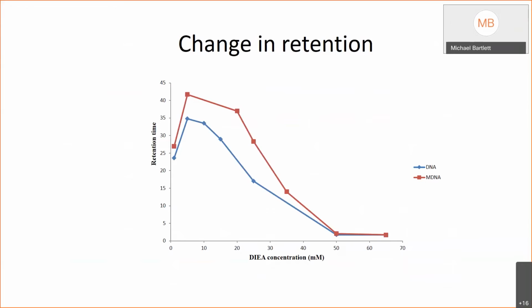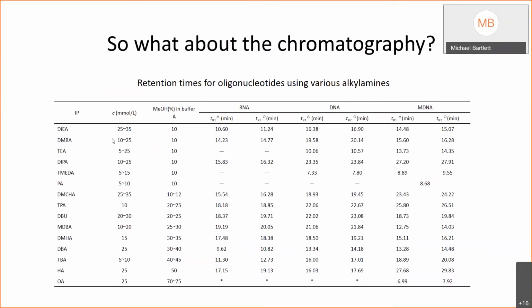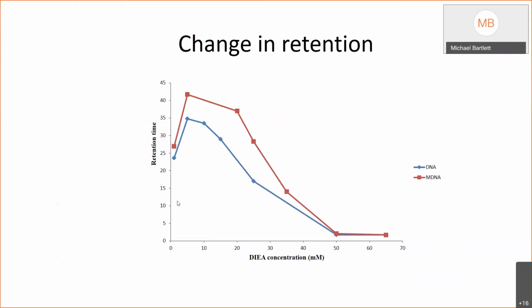This is another piece of data that was really causing me a lot of concern the first time I got it. In fact, it took me about a year just to wrap my brain around this figure. This was part of our study that we were just doing before, this idea that we would look at a range of concentrations of alkylamines and try to get a sense of how they separated out. The student came back to me and said, okay, I keep stepping up the ion pair concentration, but after I get above, say, 15 or 20 millimolar, the retention actually starts getting worse and worse, and eventually just completely goes into the void volume.